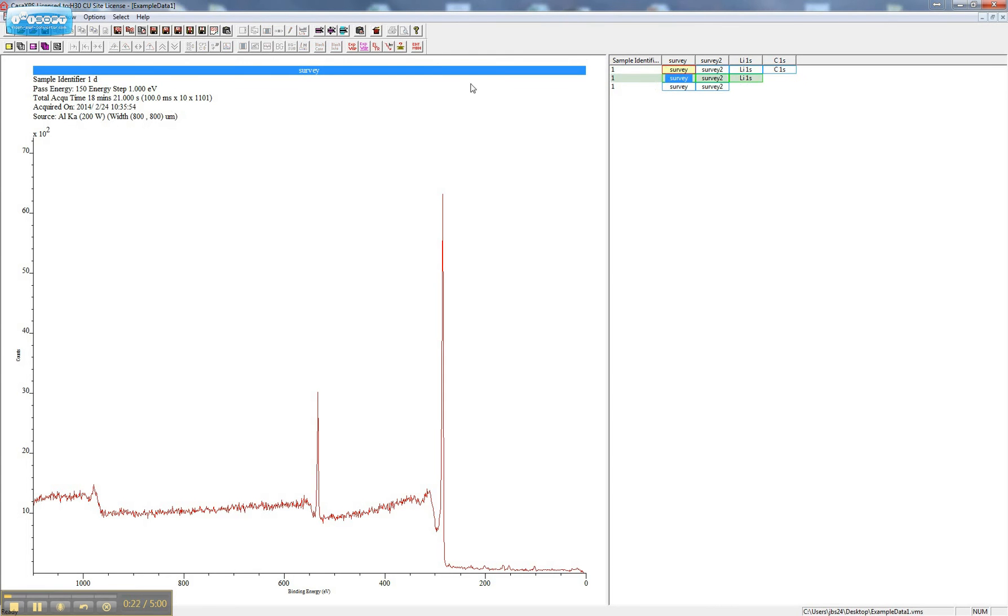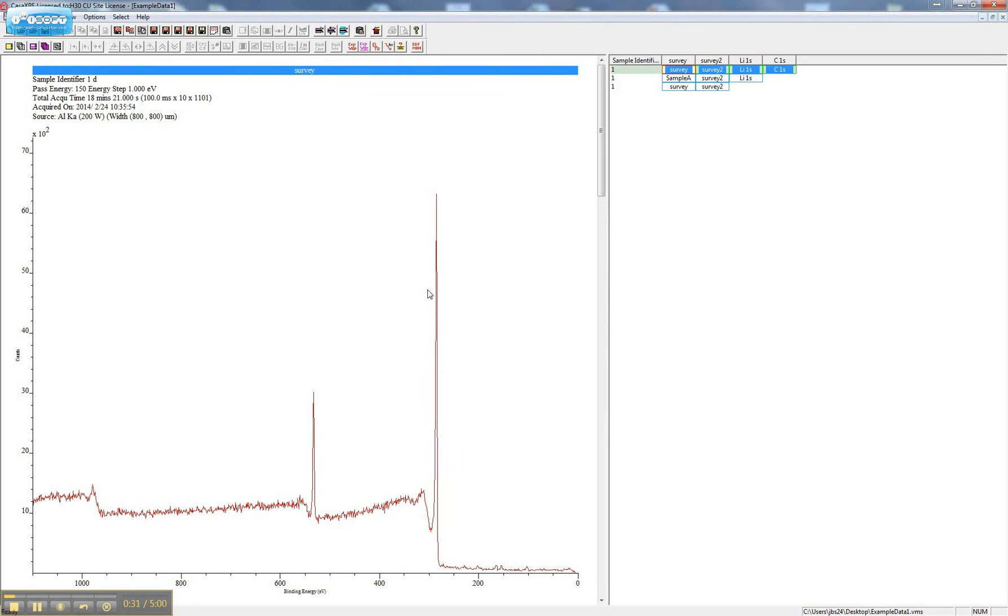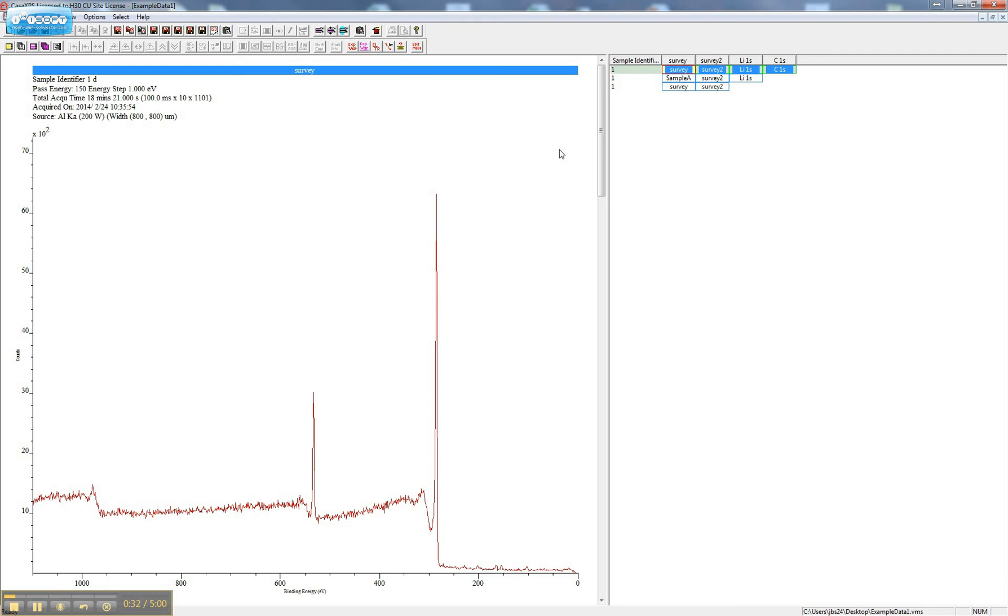You can change block names using the Edit Sample ID button. You can rearrange lines using the Edit by Row button.